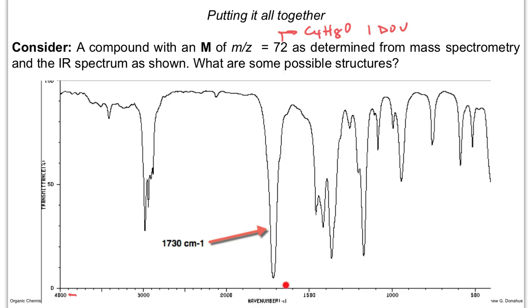So on the infrared spectrum, you have the x-axis. The units for this are kind of weird. They're called wave numbers, and it's typically reported in reciprocal centimeters. That deals with the wavelength of IR light normalized to a certain unit.